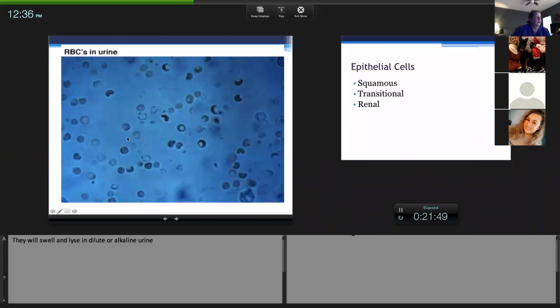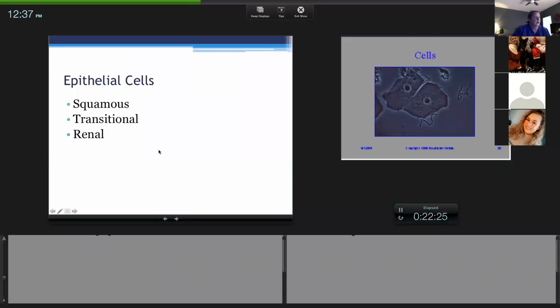Now, these red blood cells, they're all kind of universal. You've got some white blood cells, these bigger ones, and these are RBCs. Sometimes they have this crescent shape because if they've shrunk in, they can become concave. But most of the time you'll see them dilated, and that's what they're showing. They can swell, or they can lyse. So you've got some here, look at this one exploded, that one exploded, this one's kind of bent in half. This one's maybe a little different, so different appearances.